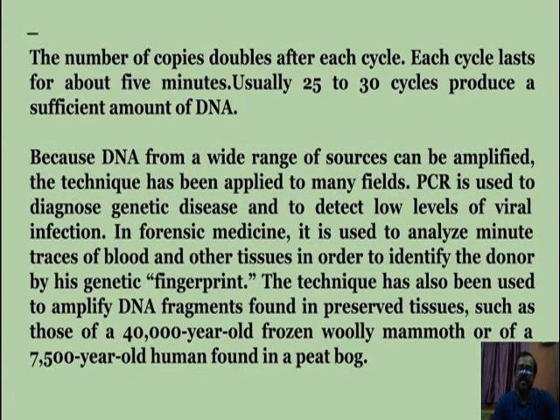That is, PCR is used in diagnosis of genetic diseases and to detect low levels of viral infections, in forensic medicine, in criminal investigations, in genetic fingerprinting.